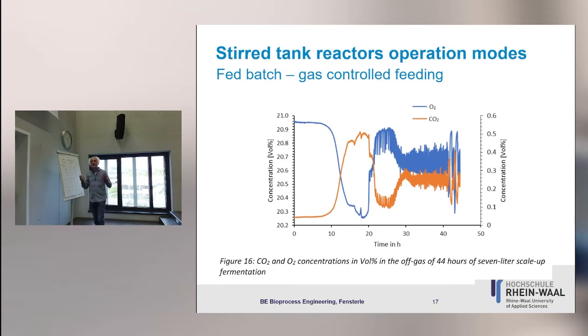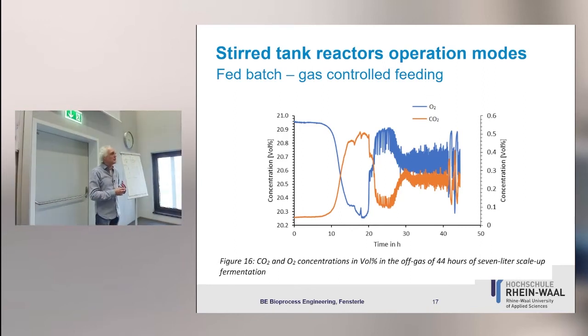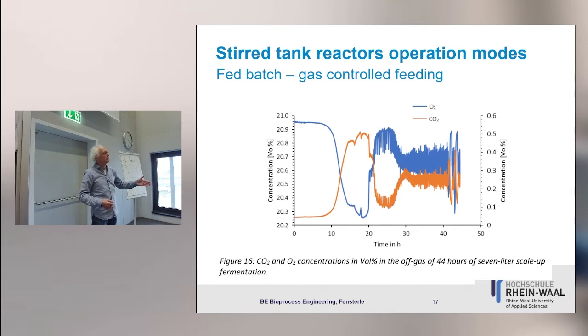And she fed an acid which is toxic and always looked at the gas, and as soon as there is a drop of the gas, the pump was programmed to pump the substrate back in. Yeah? So this means that the feeding strategies can be regulated in a different way. Yeah?